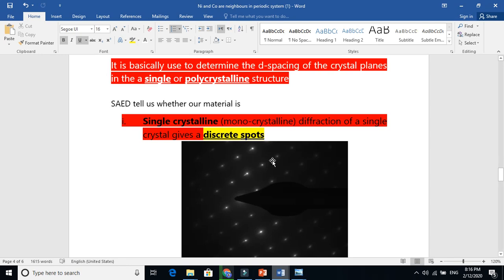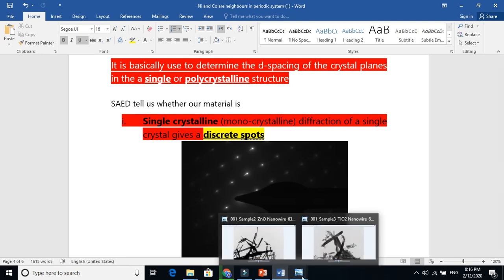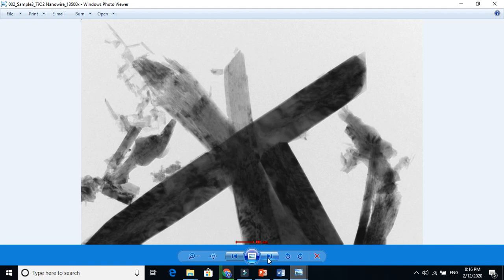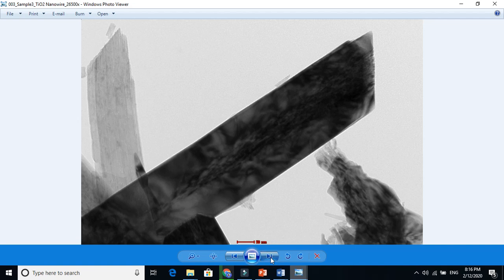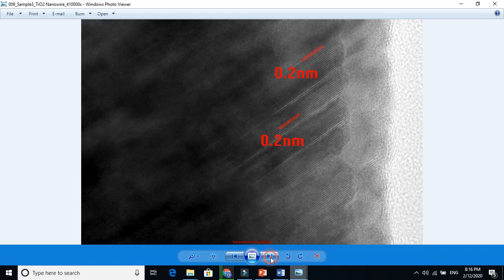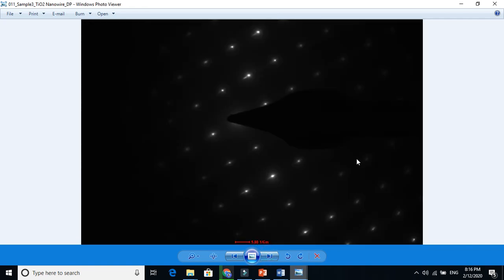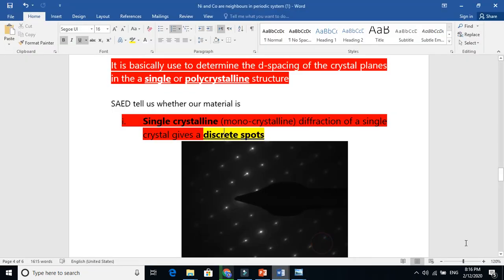Let me show you how a single crystal looks. Here is a rod-shaped crystal. You will see there are no many crystals or many grains — the whole thing looks like a single crystal. You cannot see any grain boundaries. The planes are all in the same direction, and this is why it gives us discrete spot diffraction, because this is a single crystal material.